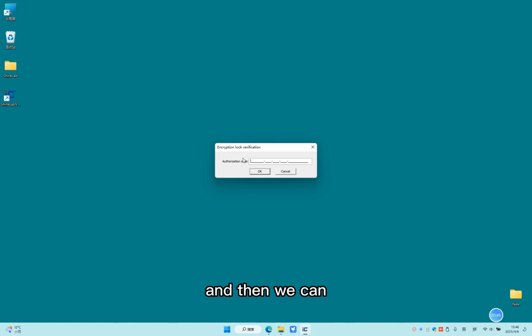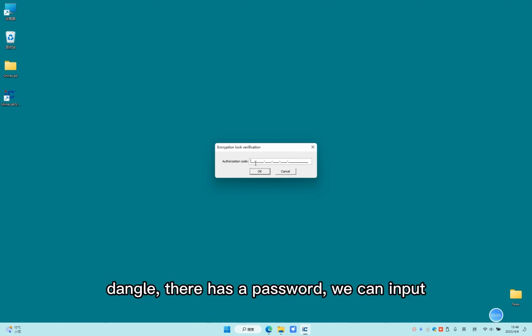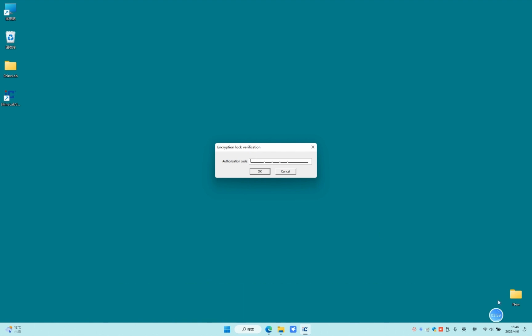And then we can find the package on the dongle. There is a password we can enter. Okay.